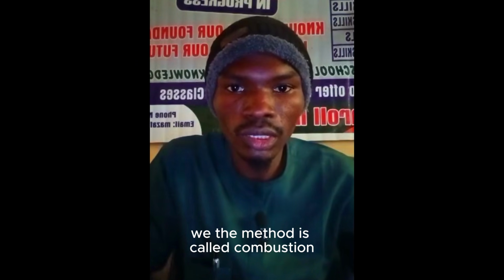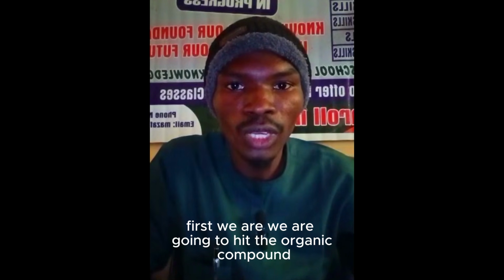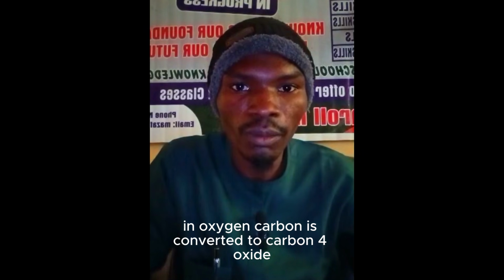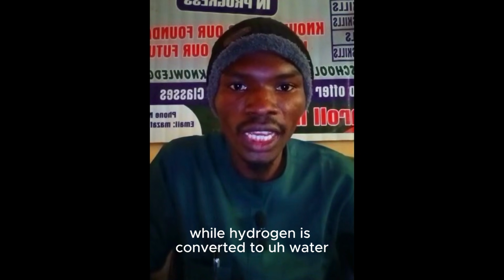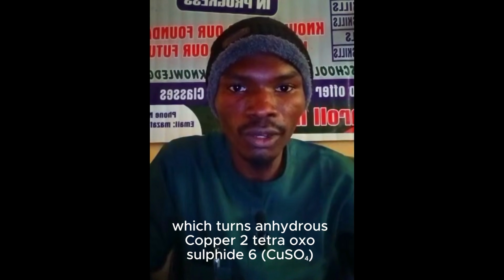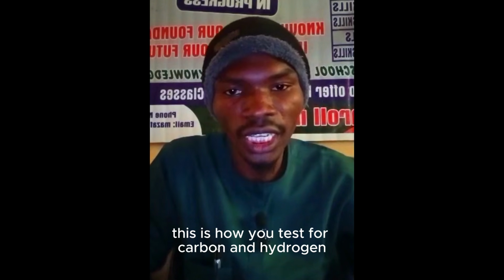The method is called combustion. And how do we do that? First, we are going to heat the organic compound in oxygen. Carbon is converted to carbon(IV) oxide, which turns limewater milky, while hydrogen is converted to water, which turns anhydrous copper(II) tetraoxosulfate(VI) from white to blue. This is how you test for carbon and hydrogen.